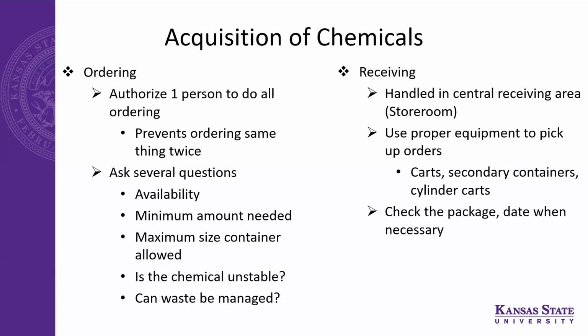And it is important to check the package whenever it arrives, right? Sometimes it can get damaged during the shipment. So once you receive a package, always check whether it's in good shape. And some chemicals will have an expiration date. By mistake, they may send you an expired chemical. So why deal with an expired chemical once you have paid for it? Check the date whenever necessary too. I know in most cases the expiration will not matter, but there can be instances. So please pay attention to that as well.